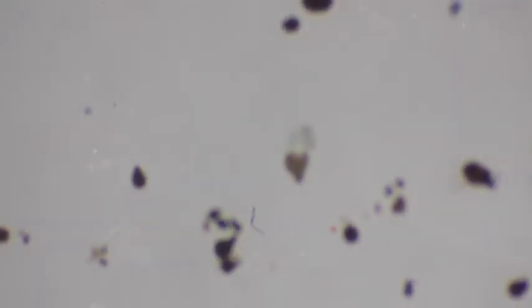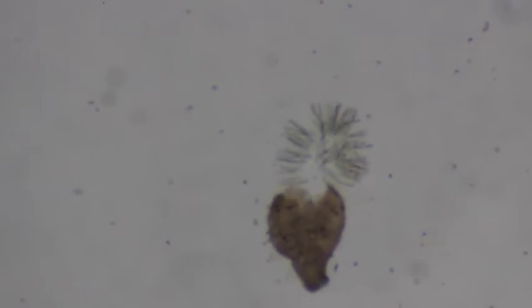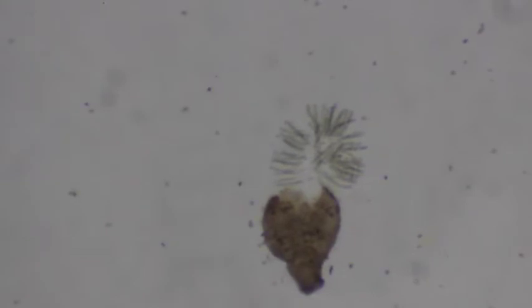We're going to go ahead and look at this underneath the compound scope here in a couple minutes. That's as close as we can get on that guy. But we can see that guy really well. We can see how I pushed on it, I exploded it, and then out of that perithecium or mushroom, we can see how we have all of those chains of spores stuck together. So you have kind of a little rosette of chains of spores all sticking out on that guy. Now we're going to look at these guys underneath a compound scope, get up under a lot higher magnification to be able to do the next step in the estimate.